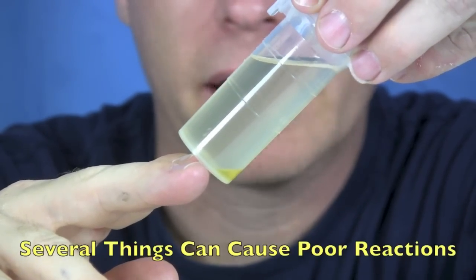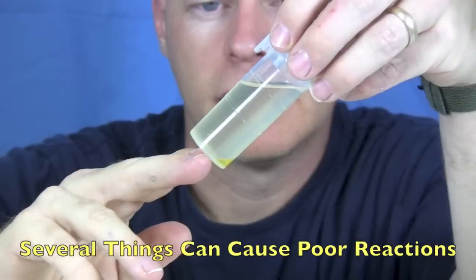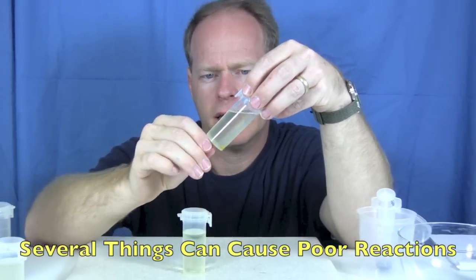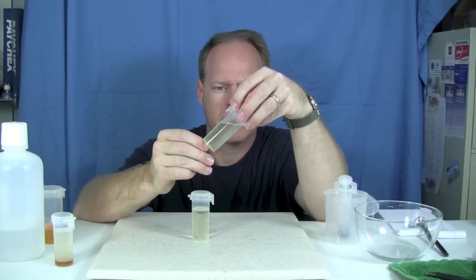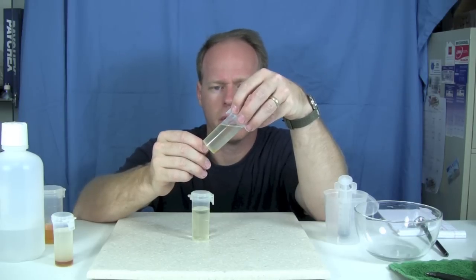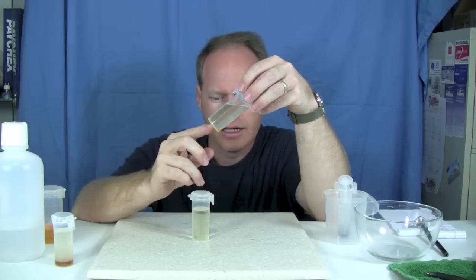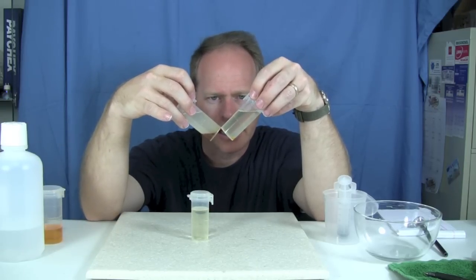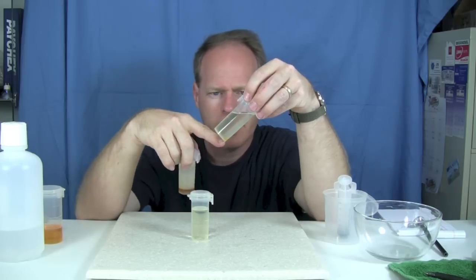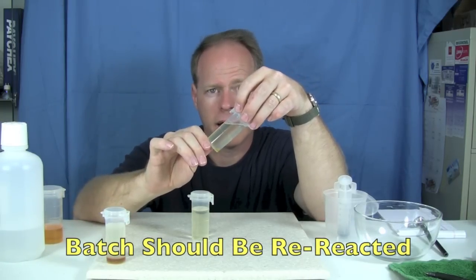What causes bad reactions are water in the oil, catalyst that's going bad, not adding enough catalyst, not adding enough methanol, or it just didn't mix real well. I can already tell that this is settling out quite a bit. I don't have the full 3 milliliters settling out, but I do have a fair amount, so I would re-react this batch.